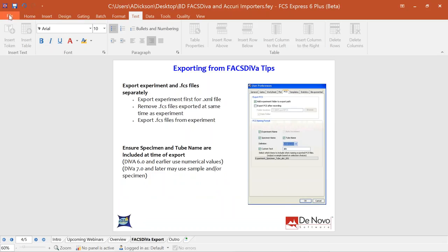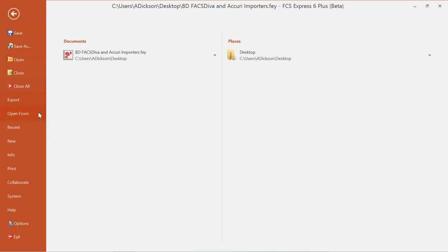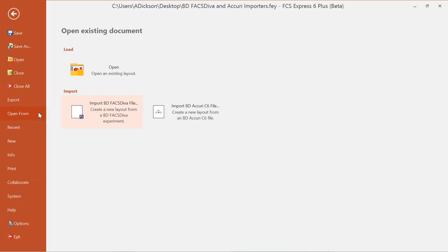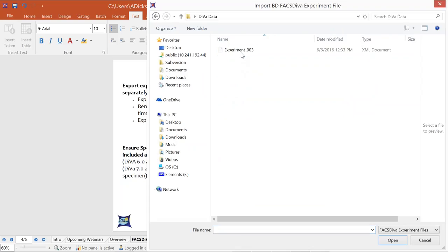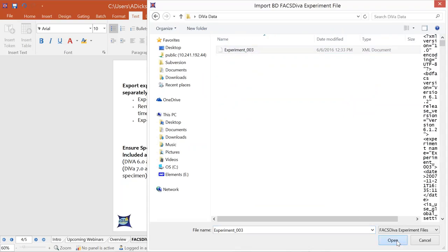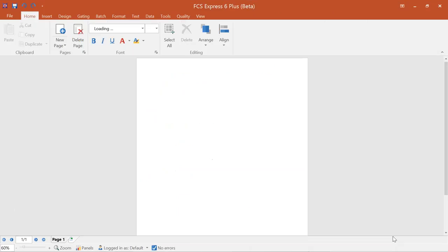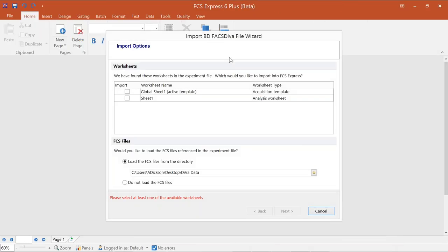To begin with the importer, go to the File tab at the top and choose Open From — about halfway down the list. When you select this option, you'll see existing layouts or your two importers. We'll start with importing from BD FACS DIVA. Click on that, navigate to your DIVA data folder, select the XML document, and click Open to initialize the wizard. The first two options in the wizard are defining which worksheets you're importing and whether to add FCS files at this time.